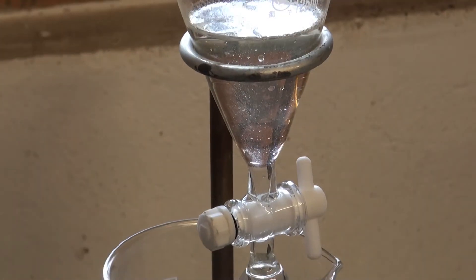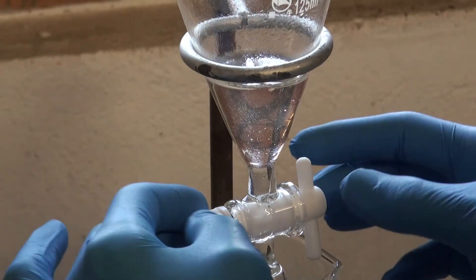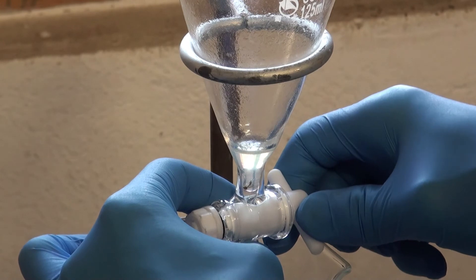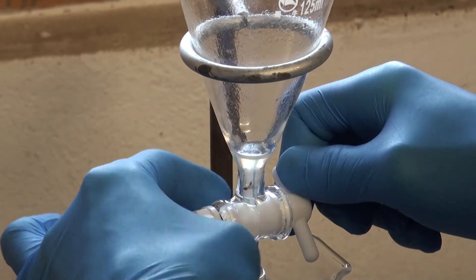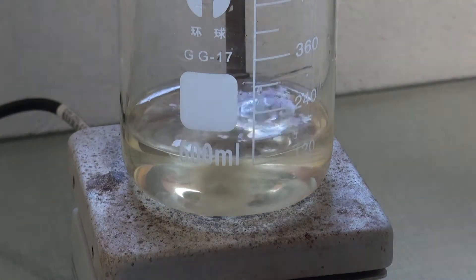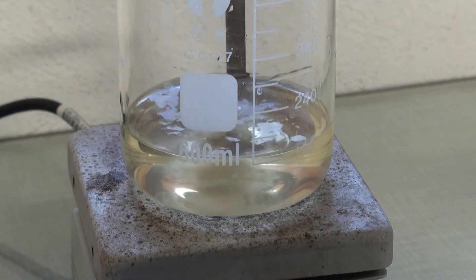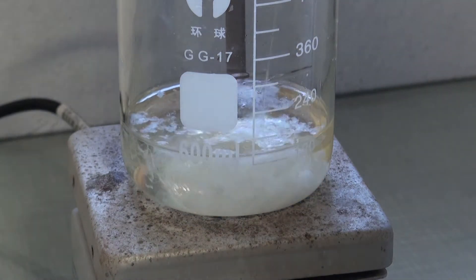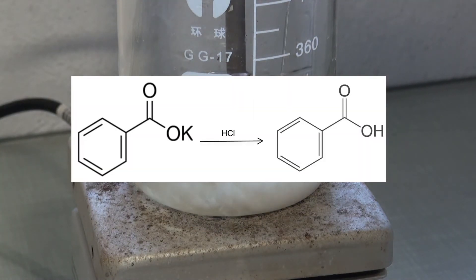The leftover organic layer was separated off and the aqueous layer was added to a beaker. To this hydrochloric acid was added. Directly after the addition, a white precipitate was observed. This is the water-insoluble benzoic acid.